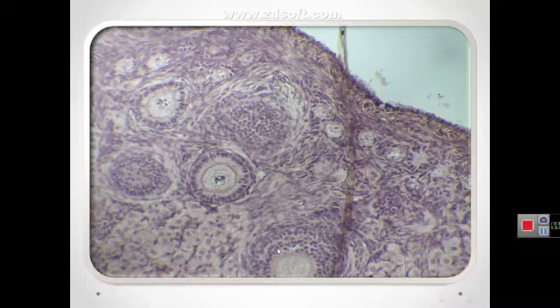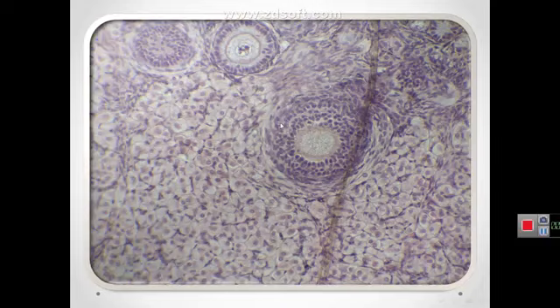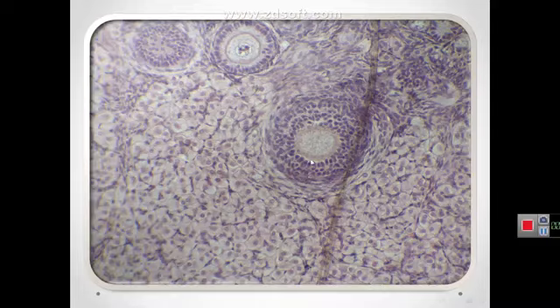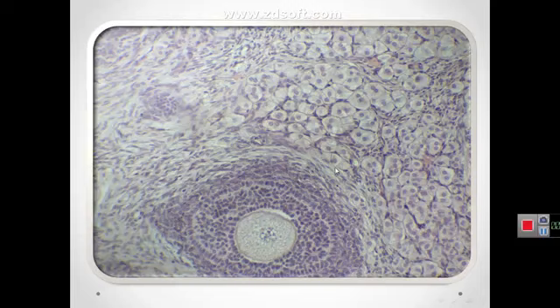The follicular cells continue to proliferate forming a stratified follicular epithelium called the granulosa, in which the cells communicate through gap junctions. The follicular cells are now called the granulosa cells, and the follicle is a multilaminar primary follicle. This is the oocyte and these are the granulosa cells.